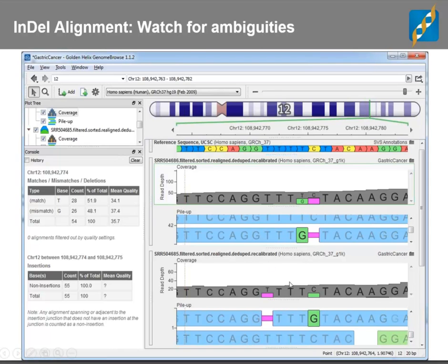This is a perfect example. So here we have two samples, but they actually have the same haplotype at that region. If I'm going to read this haplotype left to right, it's GG. I'm going to read the haplotype that has this mismatch and this deletion. Right? So it's GG, TT, T, G, TA. If I read it on this read, it's GG, TTT, G, TA, right? So it's the exact same thing, and you can describe it, because there's this 4-base homopolymer of a T, in two different ways. And this is the same alignment algorithm, it just happened to place it in one place versus another.